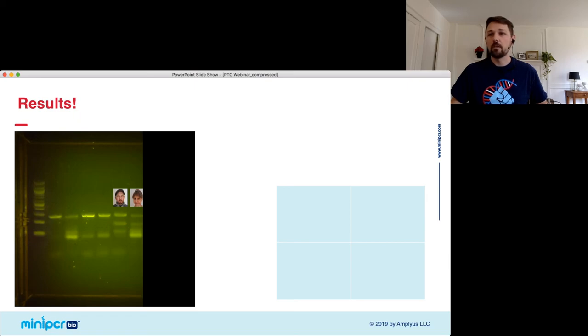Mom, look at that. Even though it's not the best DNA extraction there, we see that we still get the same results. We have two smaller bands. We also have one bigger band. Mother is also a heterozygote.